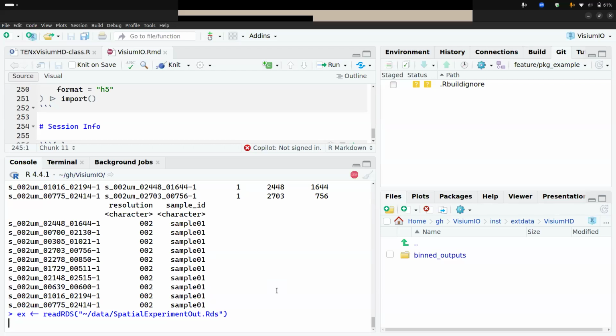Some support JSON. I haven't looked at Alabaster.